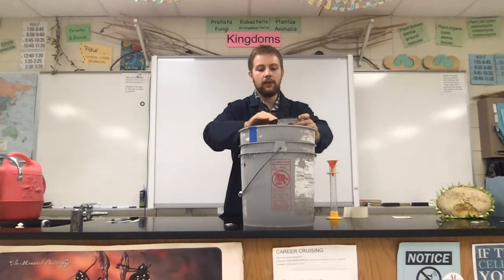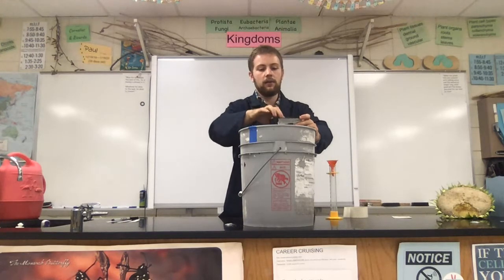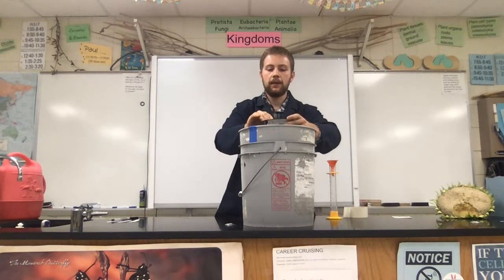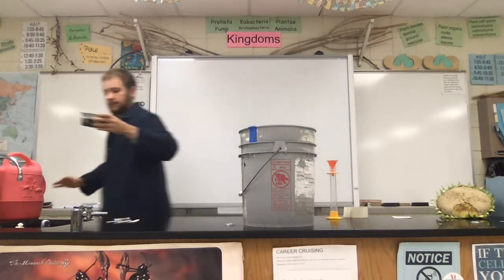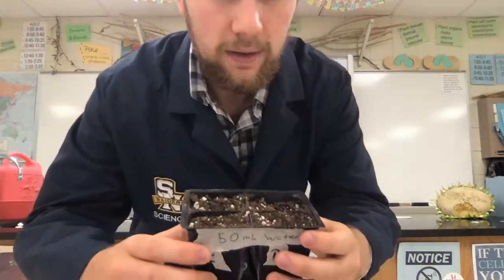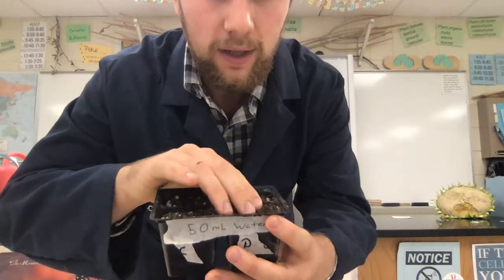So let me pat it down nice and good. We want to make sure the soil isn't overflowing so that we don't contaminate essentially our control versus our test groups. So pat that soil down gently, get it nice and firm. I'll bring this over so you can see the consistency of what we've got here. All right, so we've got a kind of a lawn of dirt here. You're going to pat it down nice and gently.